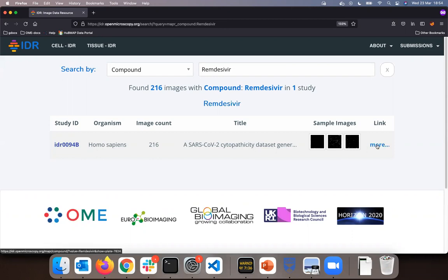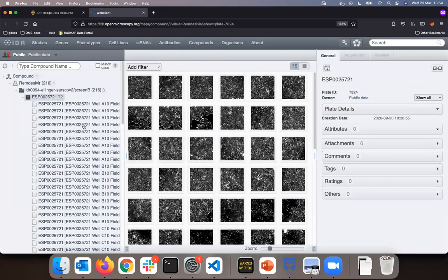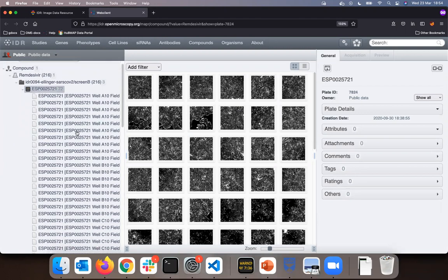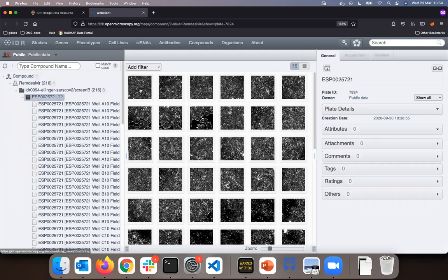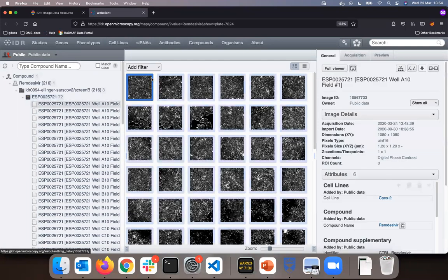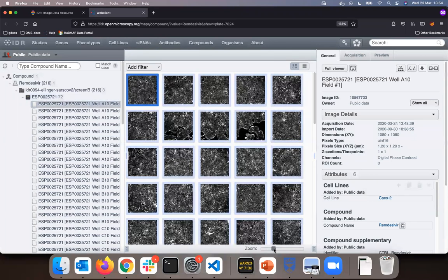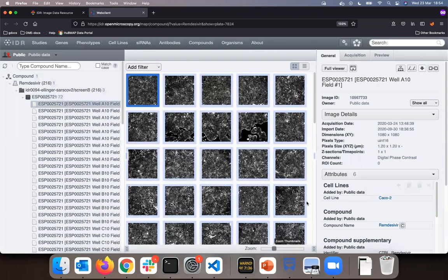I can click on more and this will lead me into the IDR itself, into an interface which we call Omero Web. Omero is the software underlying IDR. On the left are my images associated with Remdesivir. I can select the first image inside the central pane, the thumbnail of it, and zoom into the central pane.